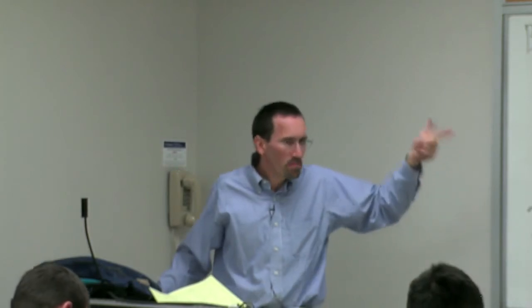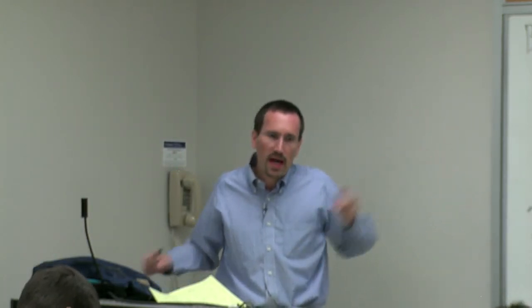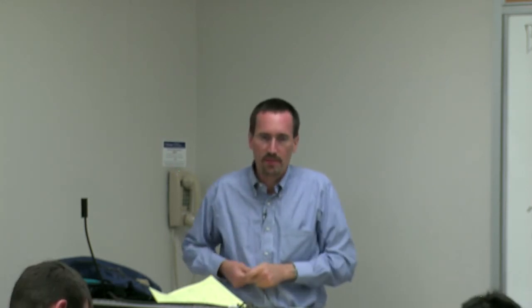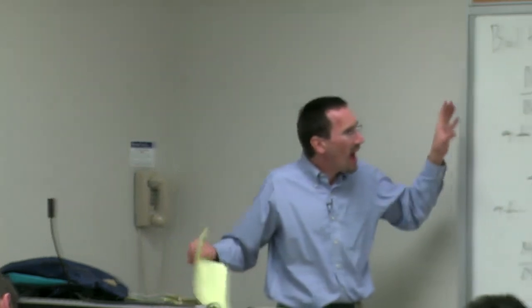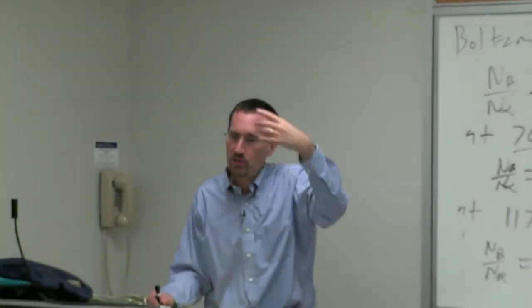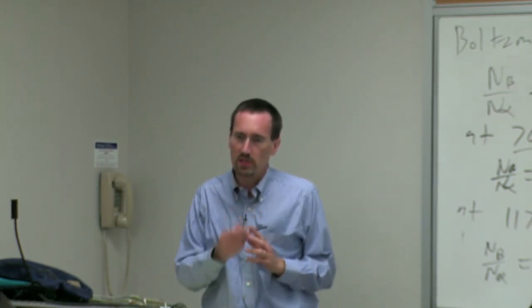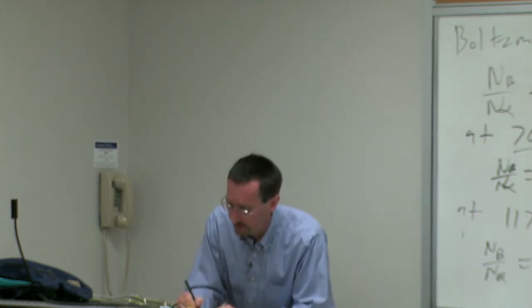So we are damned by the low energies. We are damned by the low differences in population. And this is why NMR, compared to other spectroscopic techniques, is very insensitive and why it took a long time to develop. Next time, we'll talk about how the NMR spectrometer works, how we absorb our energies, and then how we translate that into a spectrum. And I'll also talk a little bit maybe about some of the aspects of the spectrum.